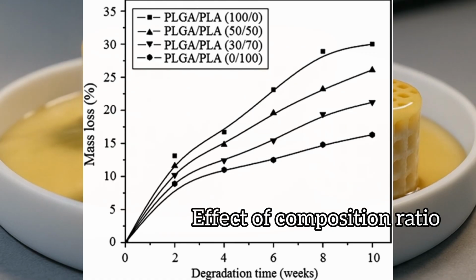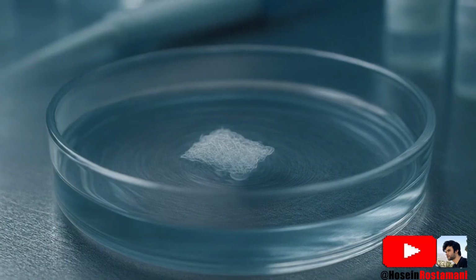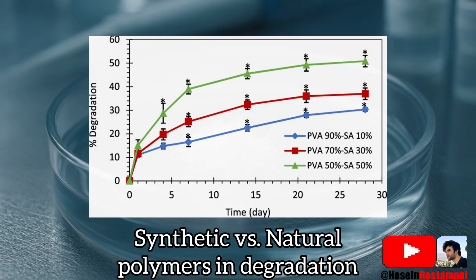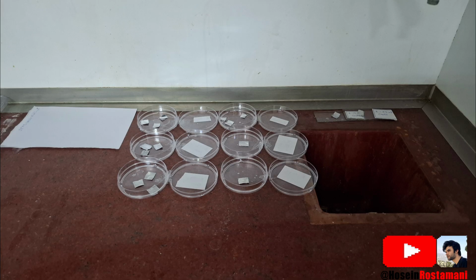All of these factors need to be reflected in the number of samples so you can draw the best possible conclusions from your experiment. This means that for each pattern, you should have separate samples for all material compositions, and for each composition, separate samples for both cross-linked and non-cross-linked types.